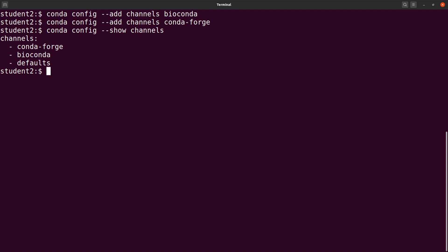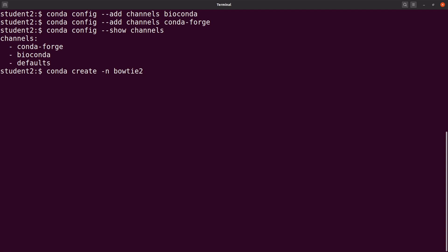Now that you have the channels added, it's time to install Bowtie2. There are a number of ways you can use to install, but I'll use just one approach here. So I'll say: conda create. Here I am creating an environment and installing Bowtie2 at the same time. So: conda create -n, and I specify the environment's name which is Bowtie. This is the name of the environment, and then we add the tool that we want to install — in this case it's Bowtie2. You can modify the name as you wish, but this one remains the same. So let's proceed and run the command.